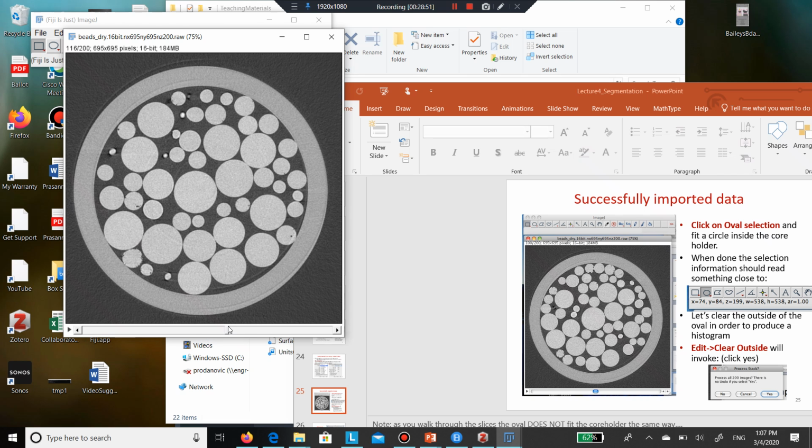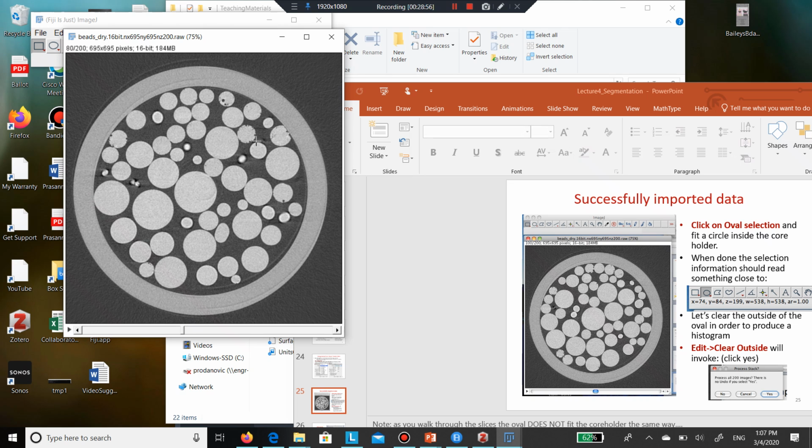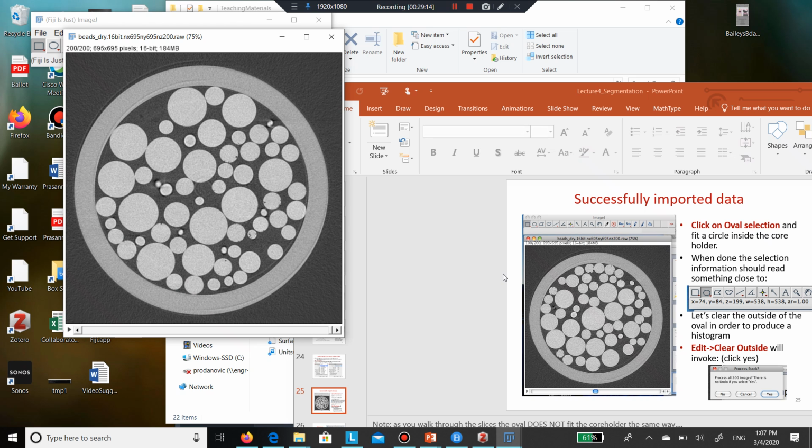And so there are certain motions, like things are supposed to be static for the 10 minutes or so that it takes to scan, and if they're not static, then you get these motion issues. Sometimes beads actually move. I mean, if they're not in a stable position, you have to put it into a container, right?